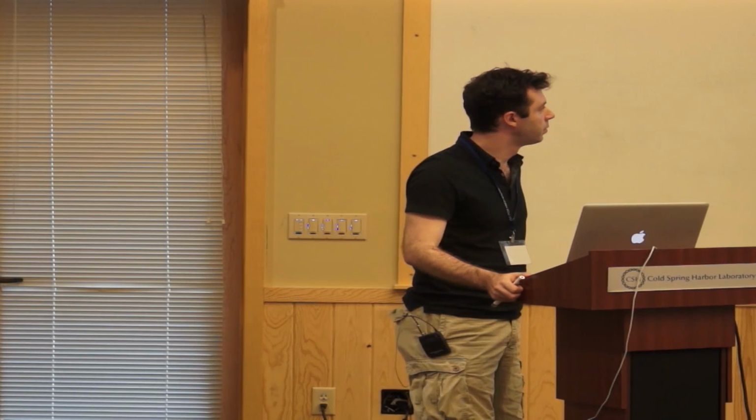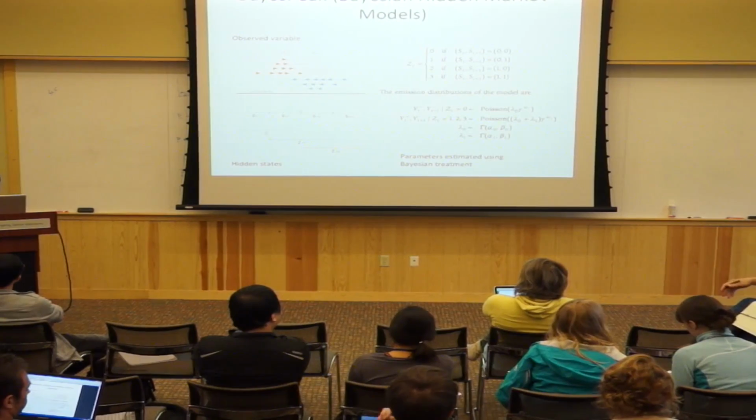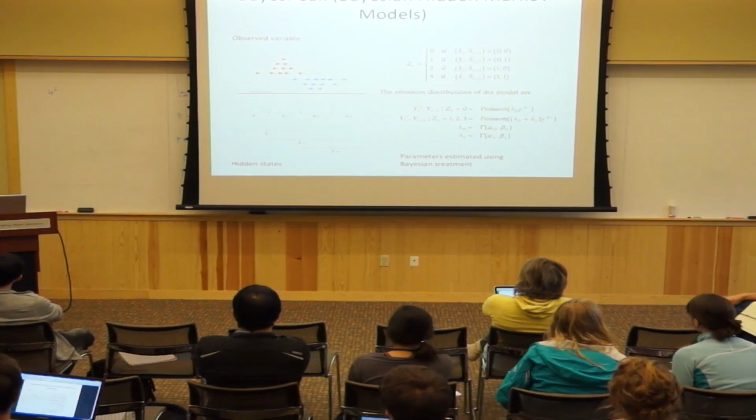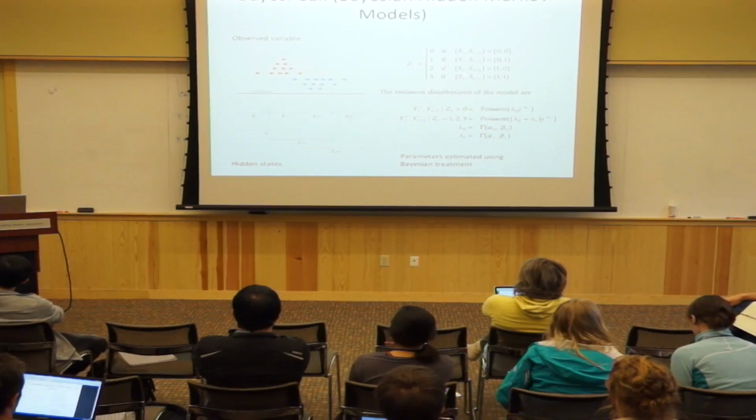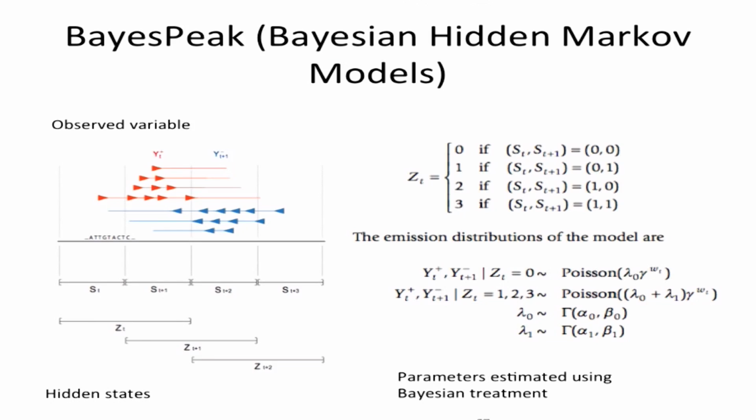Yeah. Both of these rely on having a shift right in the middle between your red reads and your blue reads. So if you're looking at a trimethyl H3K27 mark or something that's spread out over a large distance, those methods are not easily applicable to these chromatin modifications that do not form peaks. You're right, it's absolutely based on this visual shift between the blue reads and the red reads that you do not observe in these more domain-like enrichment patterns, for sure. But there are other tools that you can use in these situations.